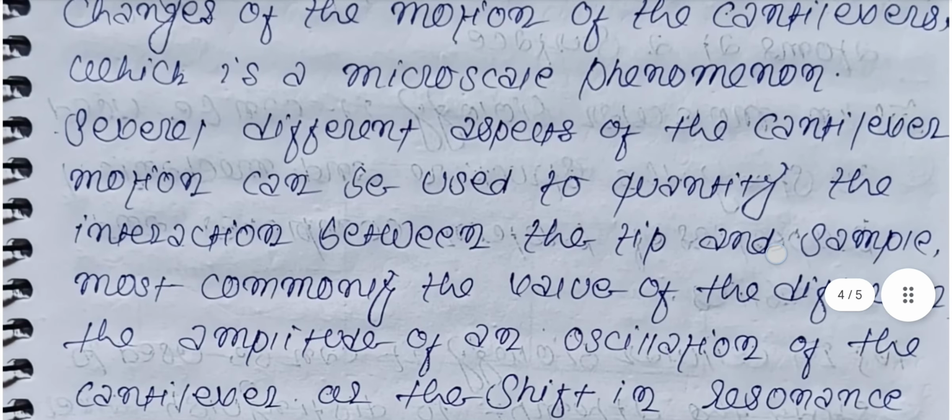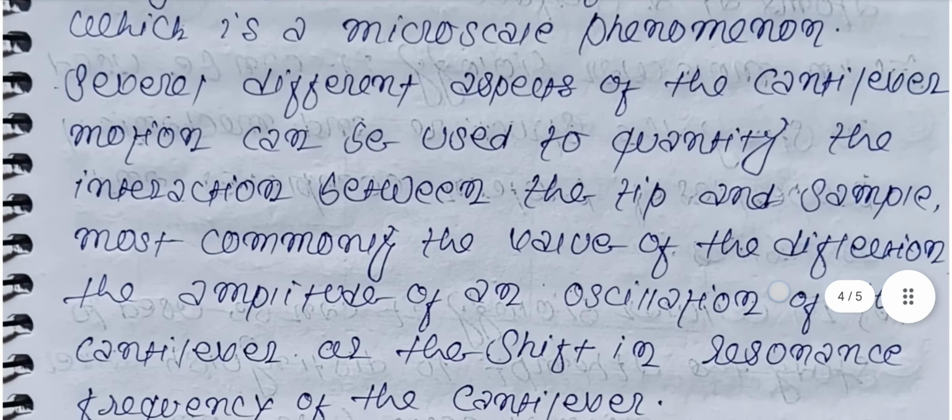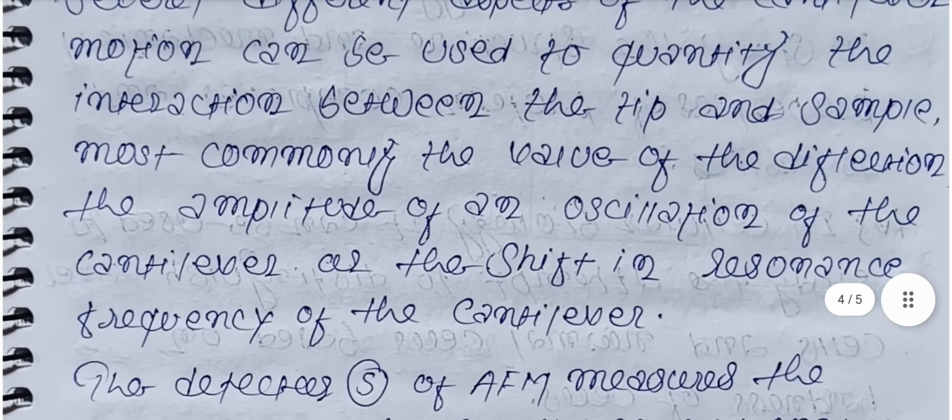Several different aspects of the cantilever motion can be used to quantitate the interactions between the tip and sample, most commonly the value of the deflection, the amplitude of an oscillation of the cantilever, or the shift in resonance frequency of the cantilever.